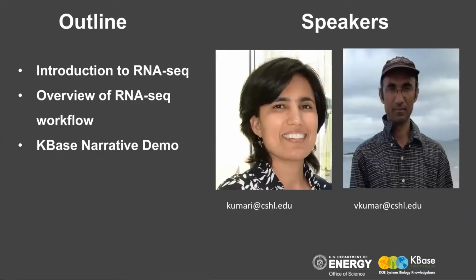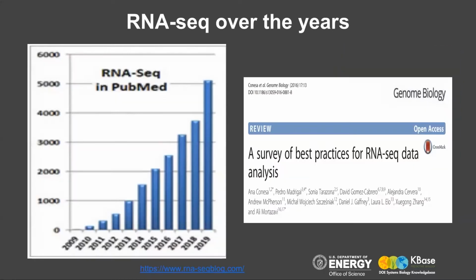So the outline is this: in this session, I will give a brief introduction to RNA-Seq and also provide an overview of the RNA-Seq workflow. And Vivek will provide a KBase narrative demo. He will walk you through the RNA-Seq workflow in the KBase narrative interface.